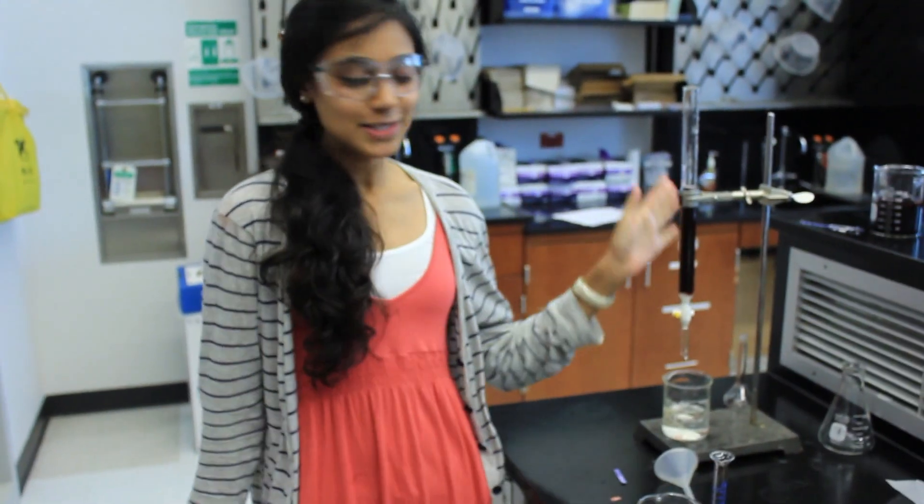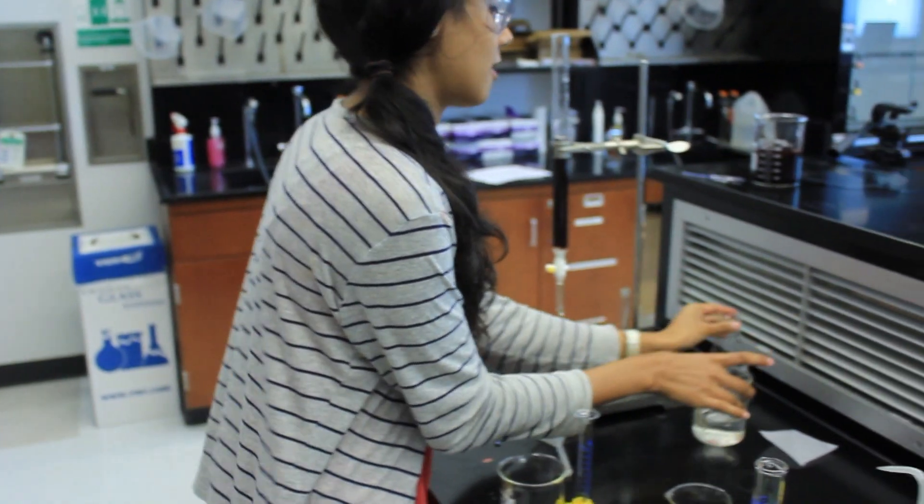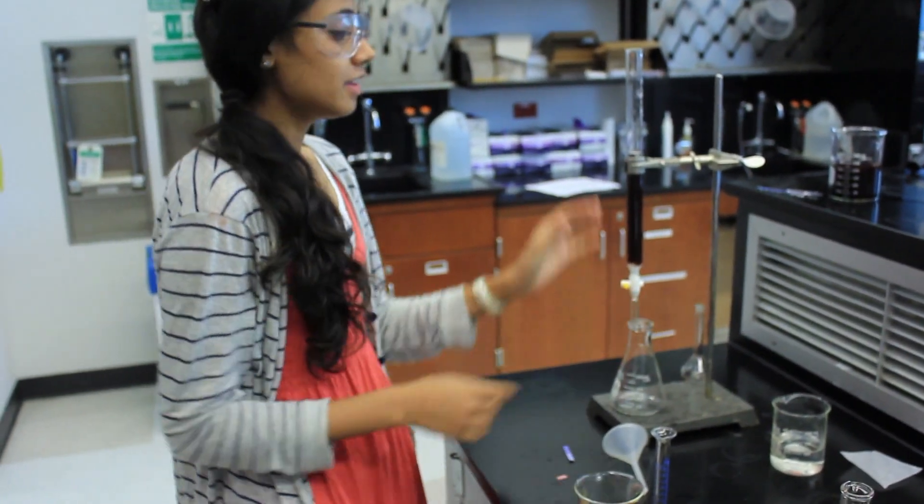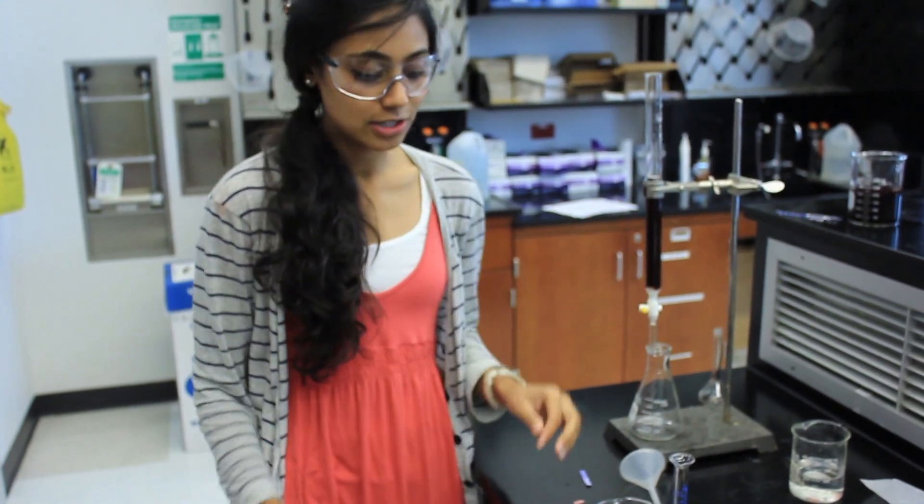Now that our effluent is neutral, we're going to switch from our waste beaker to our Erlenmeyer flask and put it underneath the column. Make sure that the water level is right above the resin slurry when it's neutral.